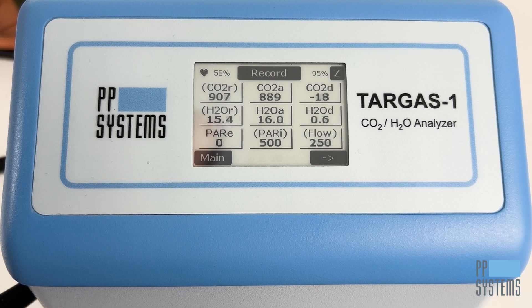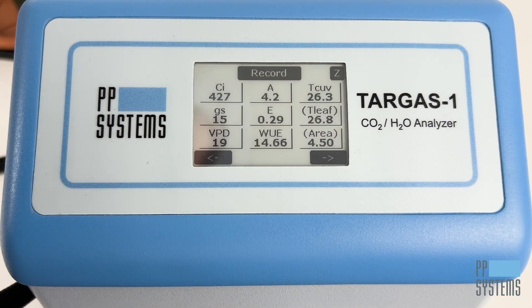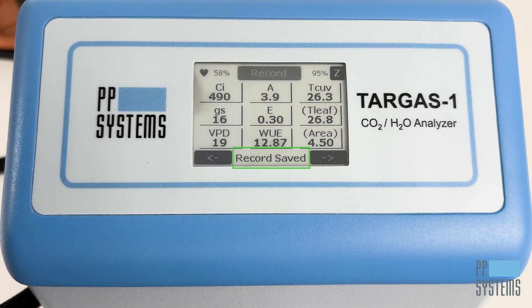The Targus One's large, high-contrast touch display offers excellent readability, and system setup and navigation is quick and easy. The pulsing heart icon confirms the display is actively on. Next to that you'll see the remaining percentage of battery power. The record button saves data as a marked record on the USB drive, and next to that you can see the estimated remaining AutoZero absorber column capacity. The Z button initiates a manual zero, and any status or error messages are displayed in the status area.